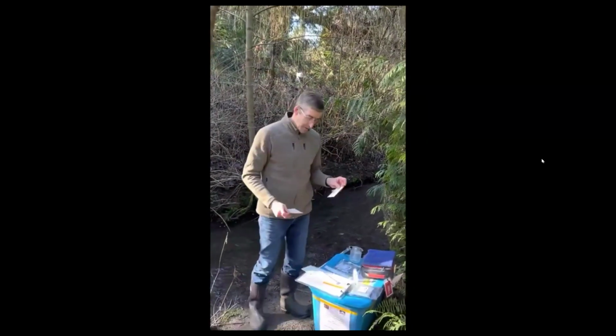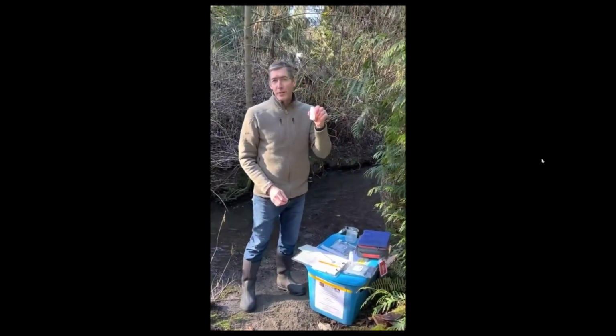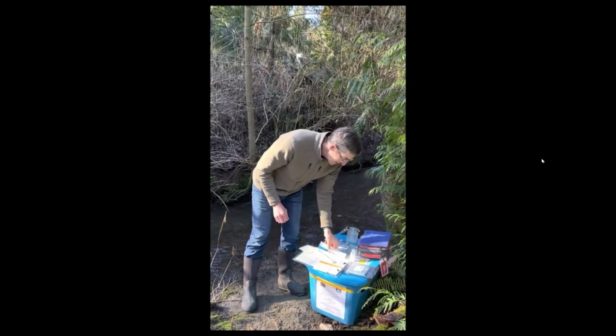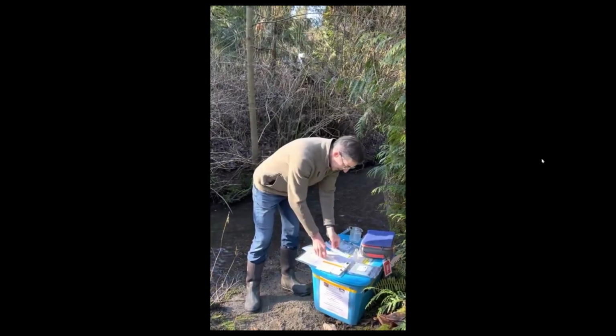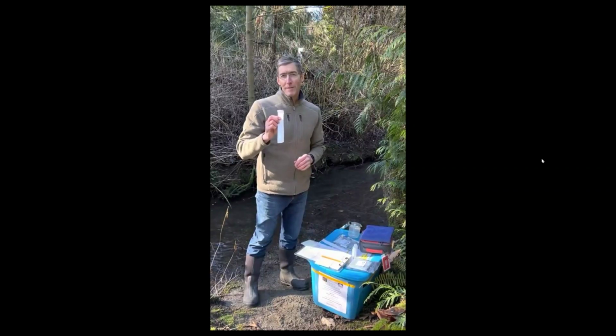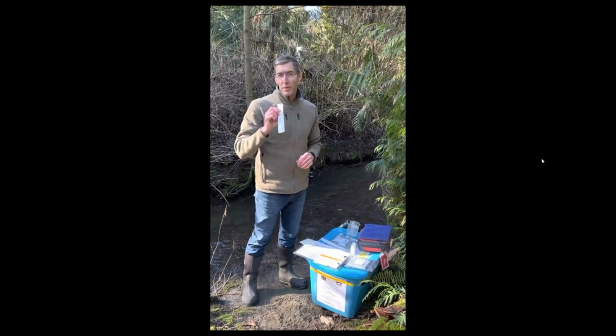Other materials that come with the R cards are a sterile container that you can collect samples in if you choose to. And they also come with pipettes. Typically we order the 1 milliliter pipette, but in some cases we like to use the 3 milliliter pipette, although we've discovered it's easiest to actually collect a 2 milliliter sample with this.